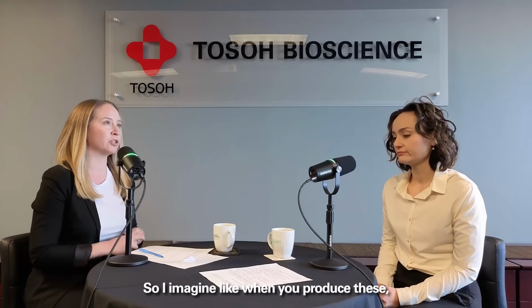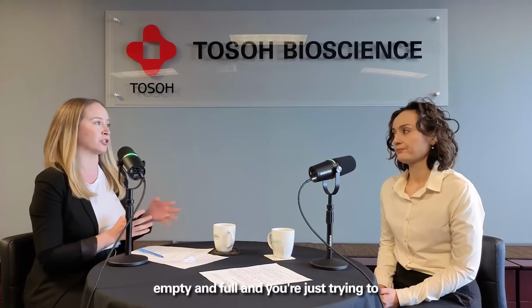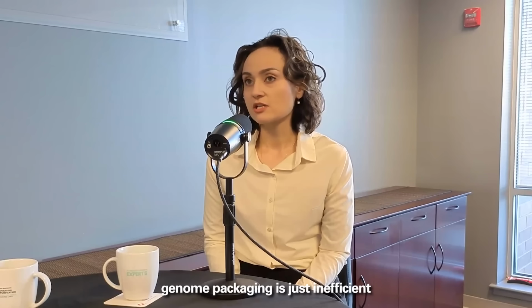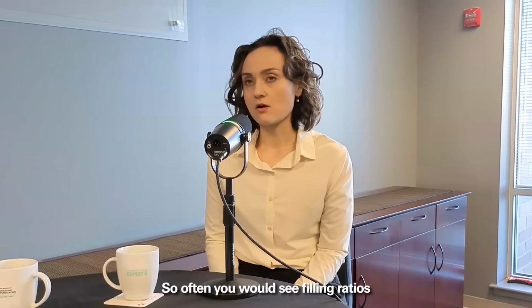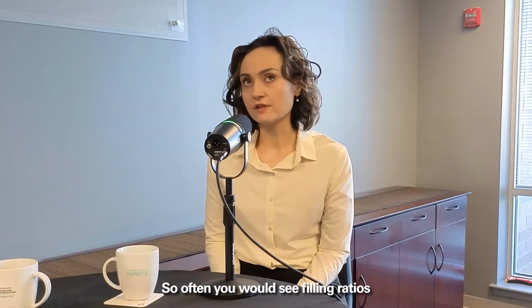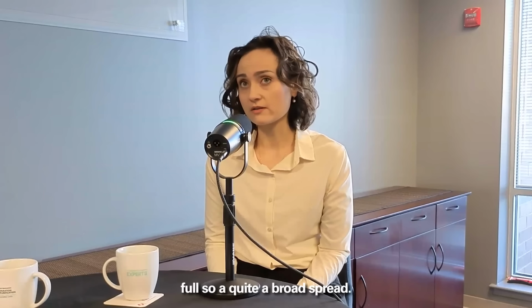Understood, yeah. So I imagine when you produce these, you are going to get a mix of empty and full, and you're just trying to get rid of as many of those empty capsids as possible. Right. The process of AAV genome packaging is just inefficient naturally, especially with this triple transfection method. So often you would see filling ratios across the board from like 10 to 50% full. So quite a broad spread.